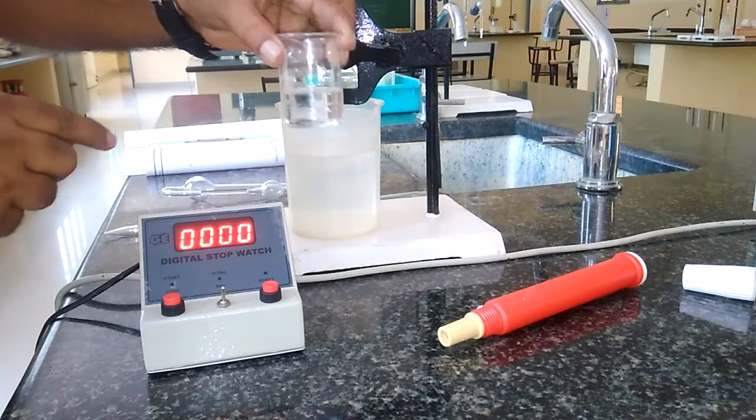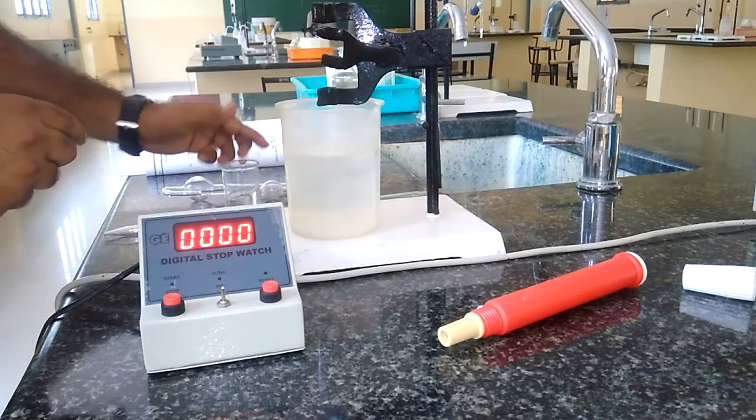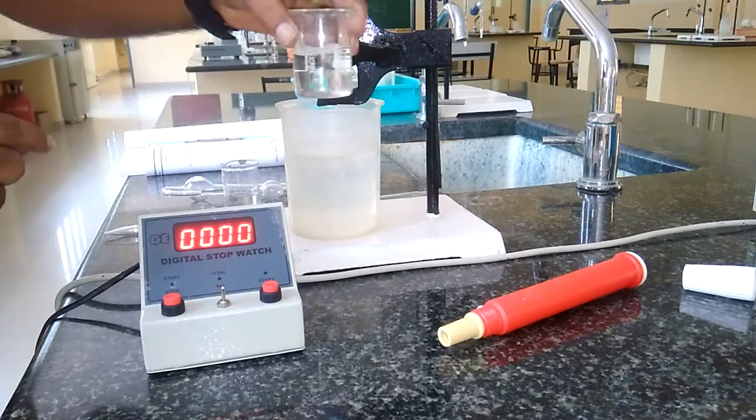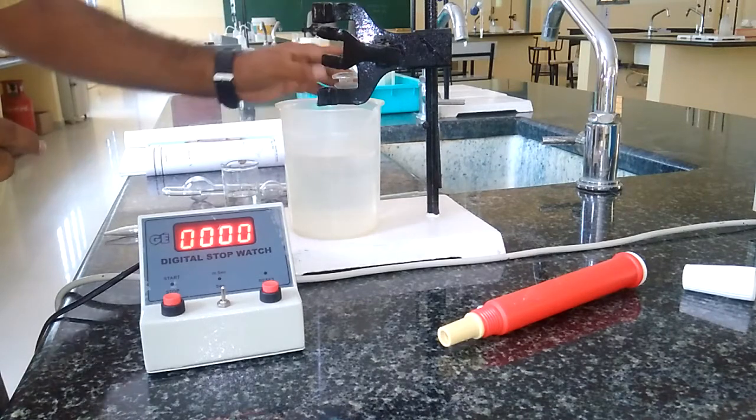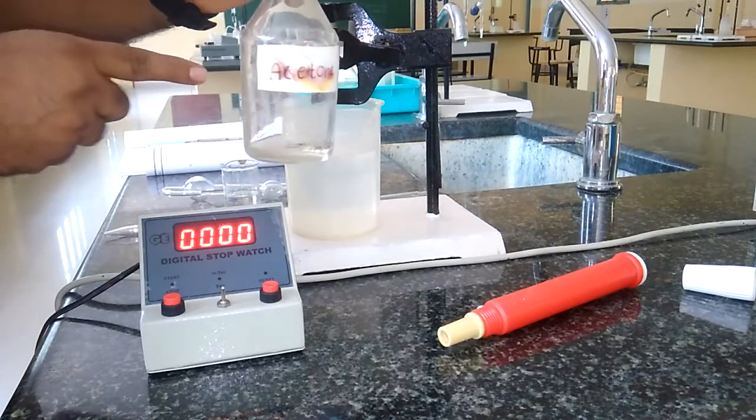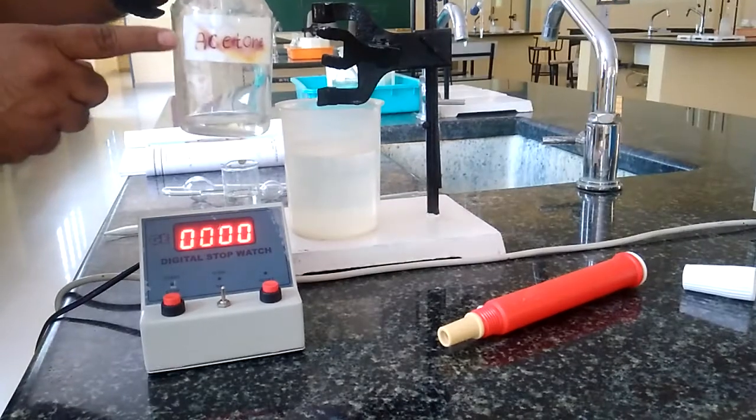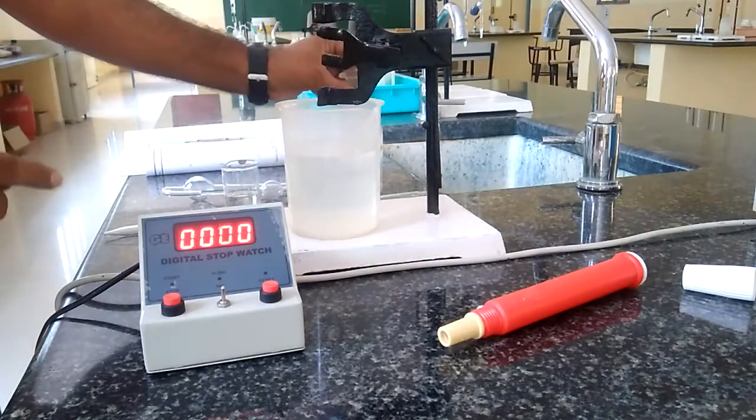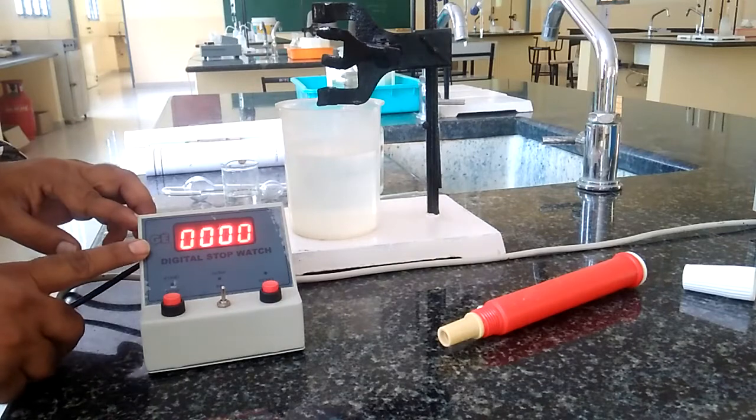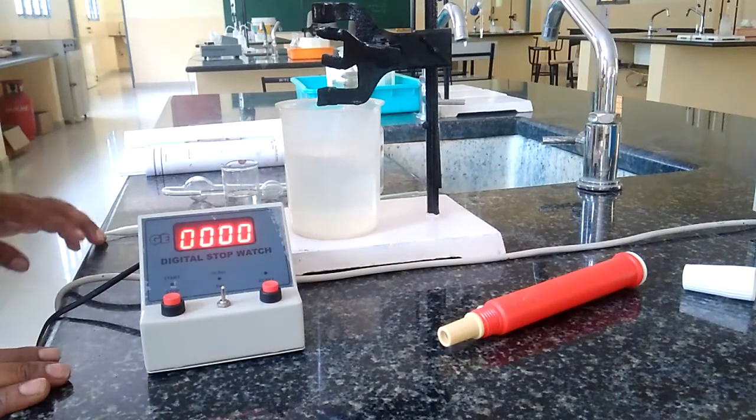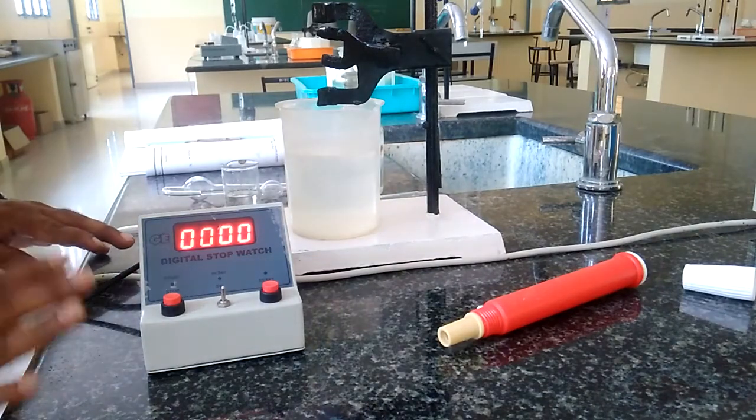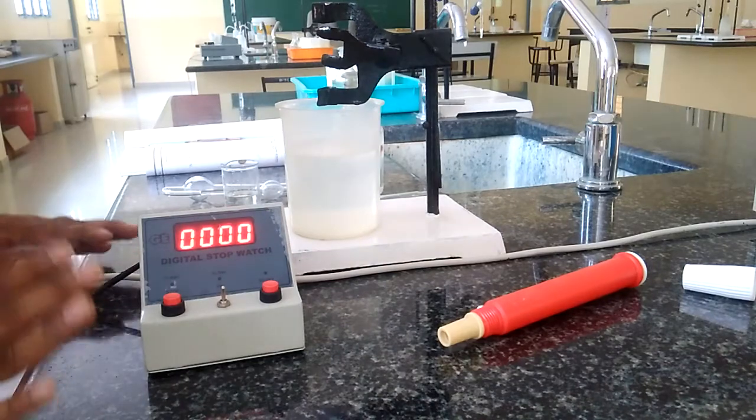Some of the chemicals we require here: the organic liquid is actually benzene, reference water we need, and acetone which is a cleaning agent to rinse the viscometer. We also need this digital stopwatch. These are the requirements, chemicals and devices we require to do this experiment.